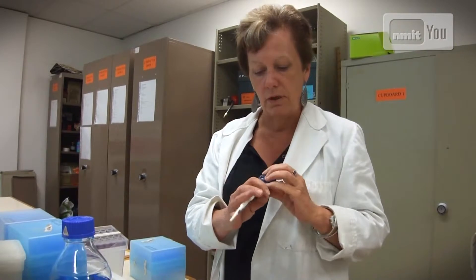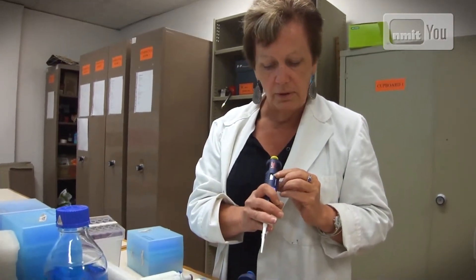It sounds easy, but it's actually something you have to feel, and it takes a while. So what we get the students to do is suck up the fluid and measure it on a balance to see if they got exactly the right amount. And they have to learn how to read the quantities.